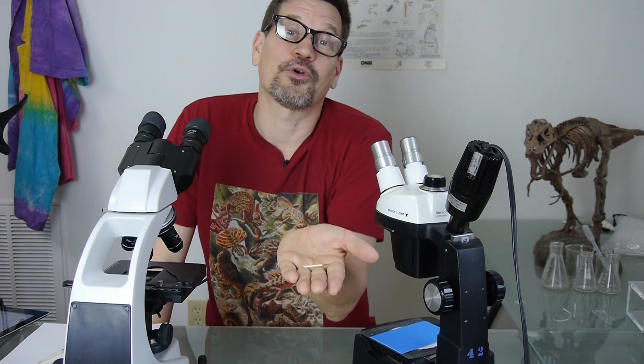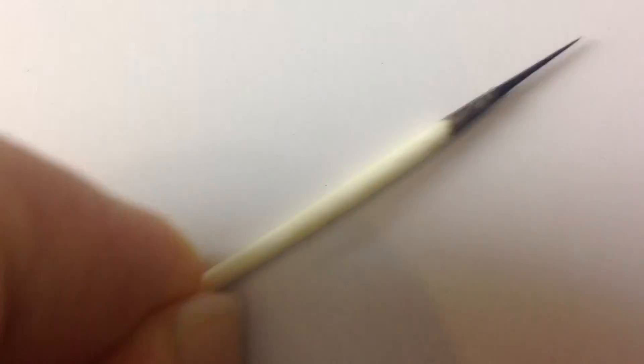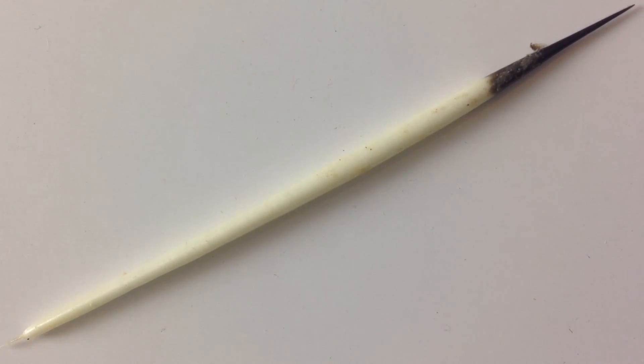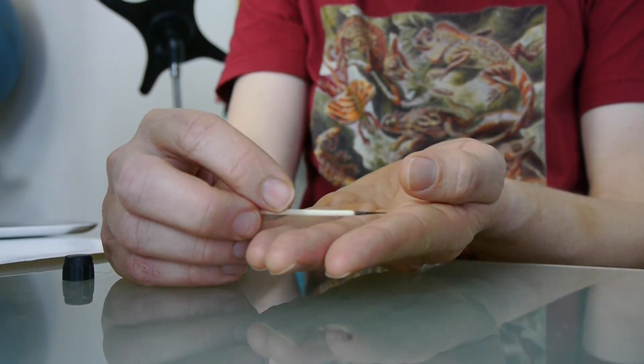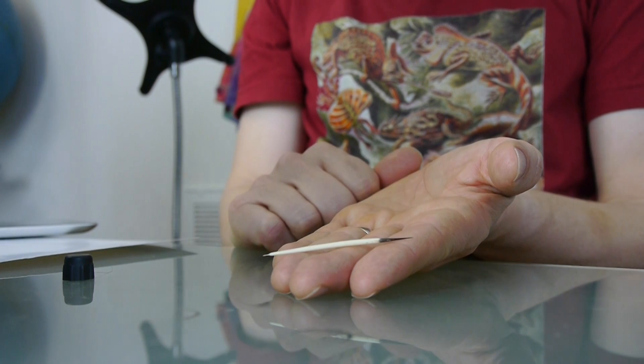Today we are going to look at the hair of a porcupine, otherwise known as a quill. Yes, a quill is just a hair, but it's got some little differences or adaptations that make it pokey. This one is from a North American porcupine — it's about as long and as thick as a toothpick, probably two inches long or so.